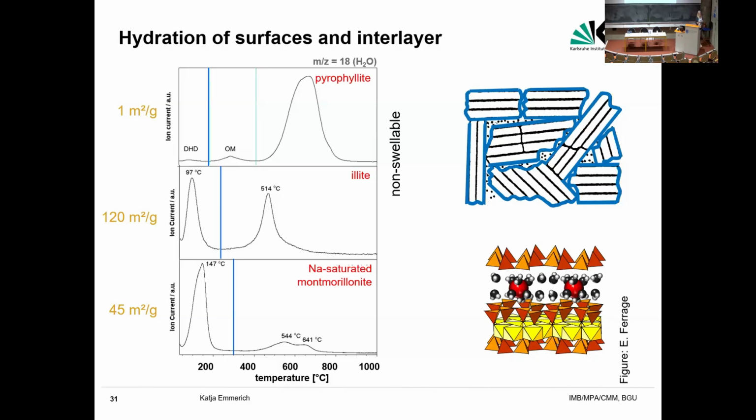This was applied in the past because, by chance, if you have an intermediate layer charge and you store the smectite or the bentonite at 75% relative humidity and you have sodium in the interlayer, if you fulfill all these criteria, then just by chance, the water that is needed for the hydration equals a monolayer of water molecules around the outer surfaces and the interlayer.